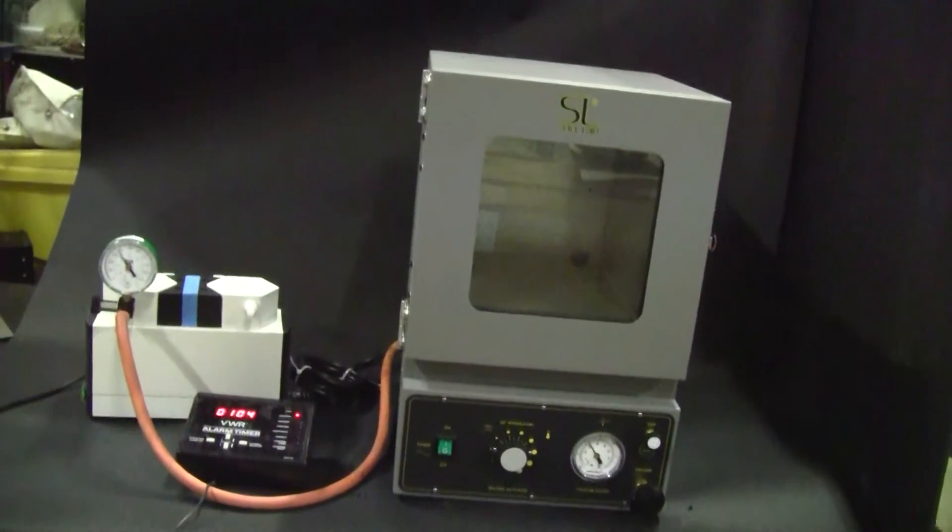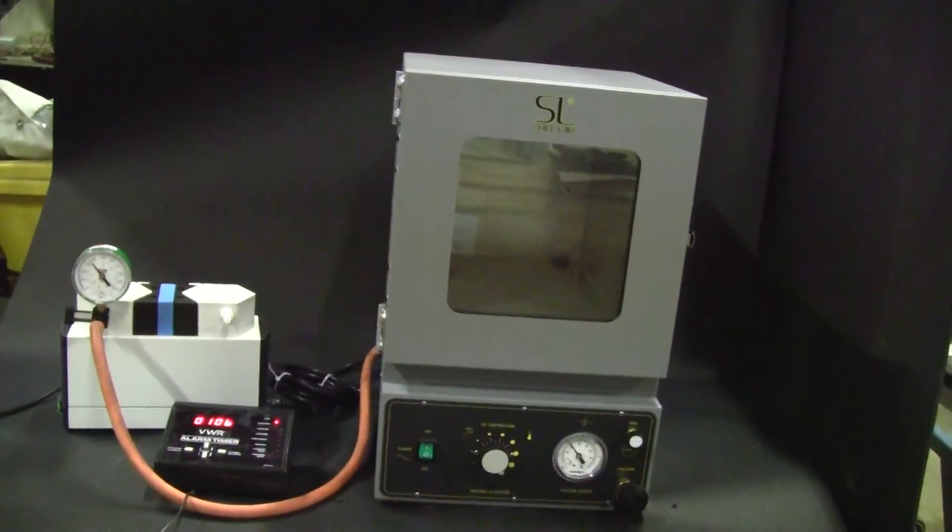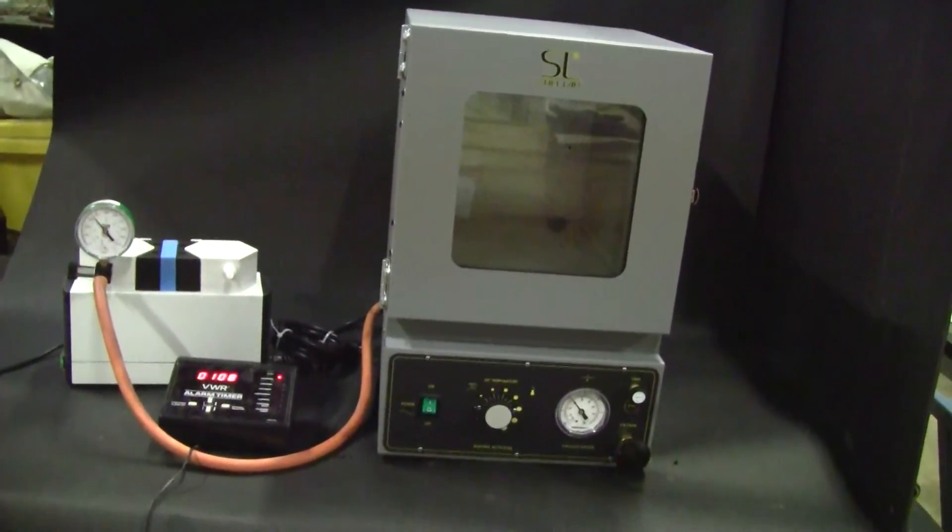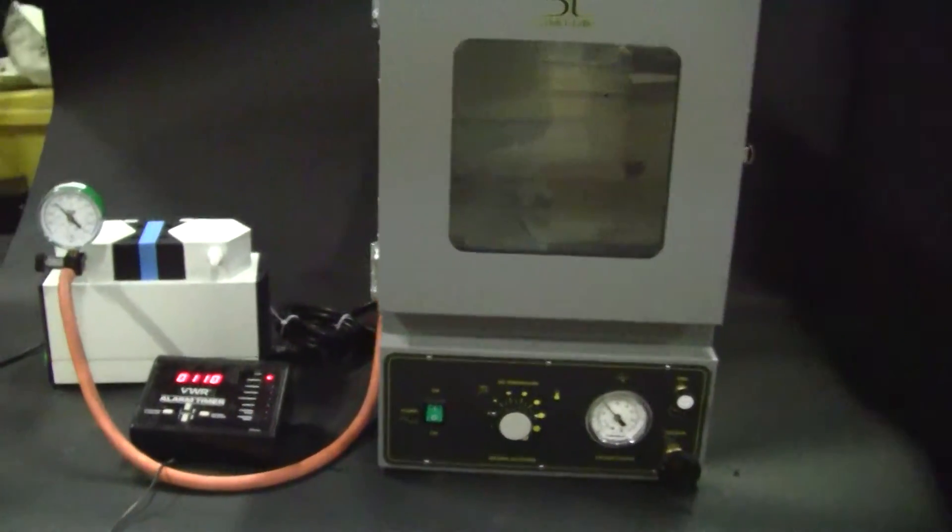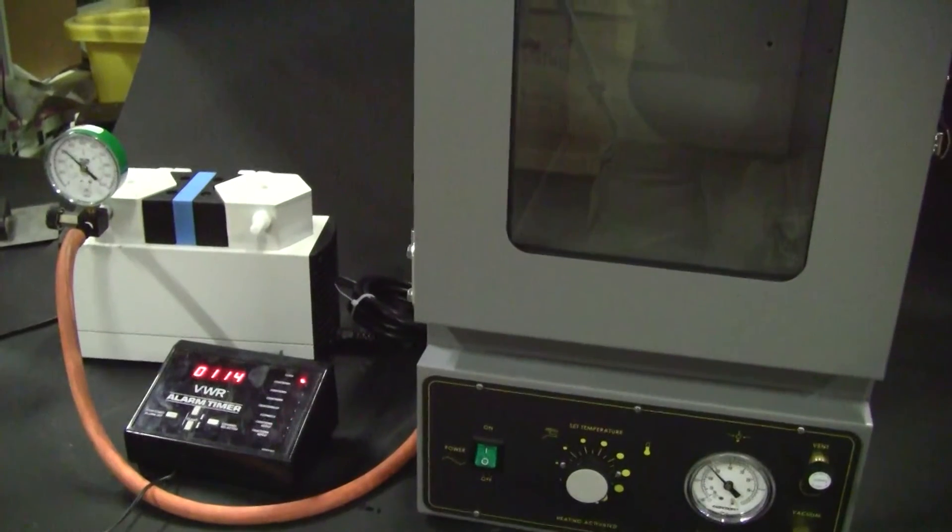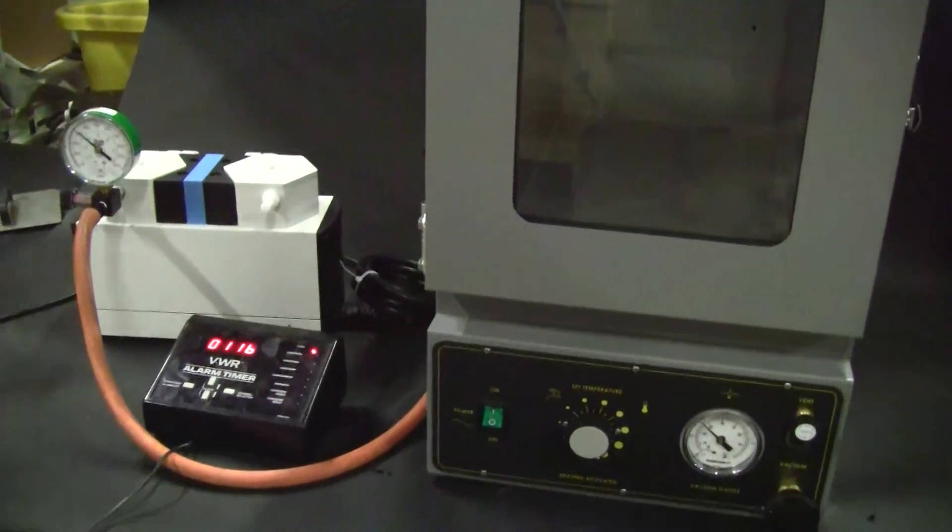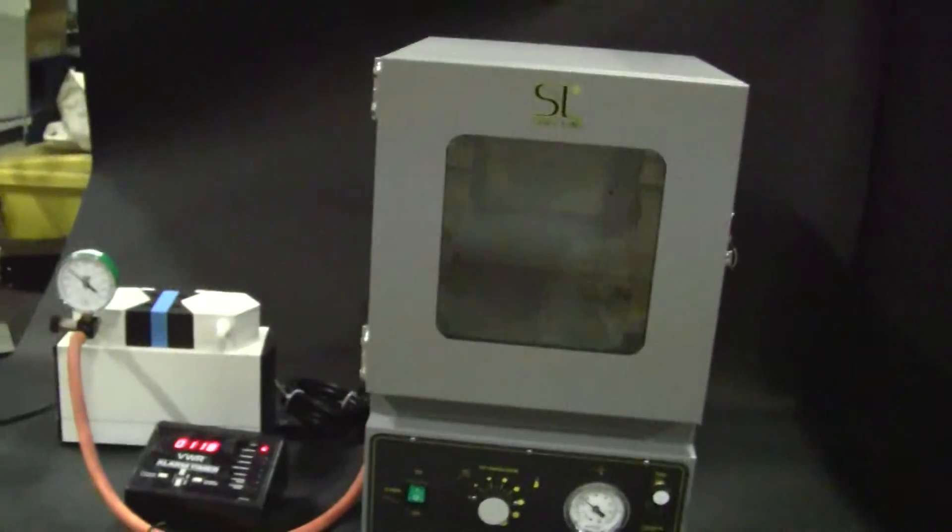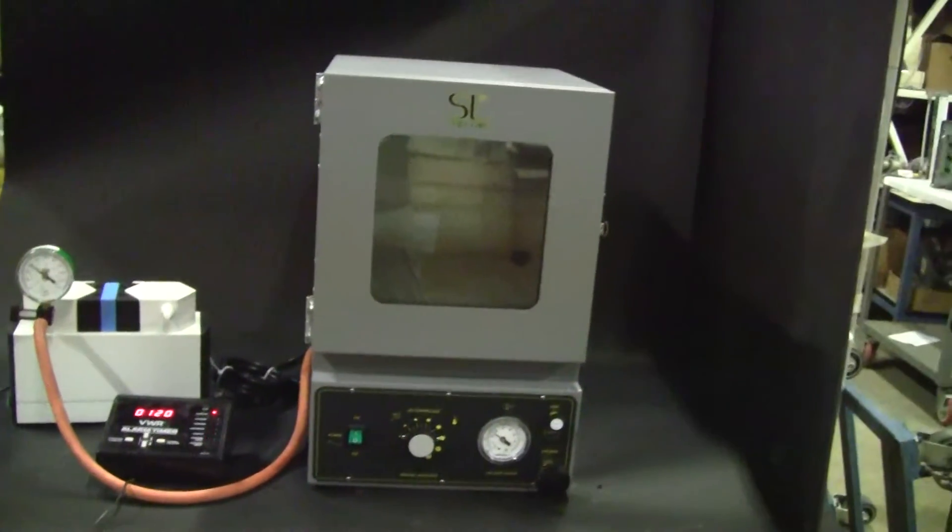High-tech traders is a source for used laboratory equipment. We do ship around the world with quality used equipment, and sometimes even new equipment. Please call for our updated inventory or get on our mailing list.